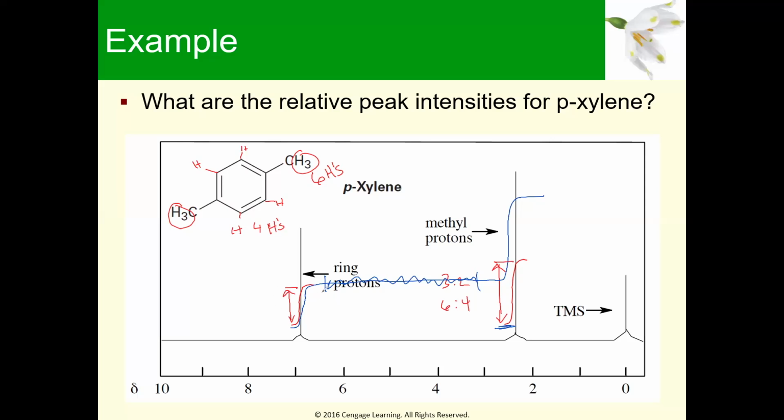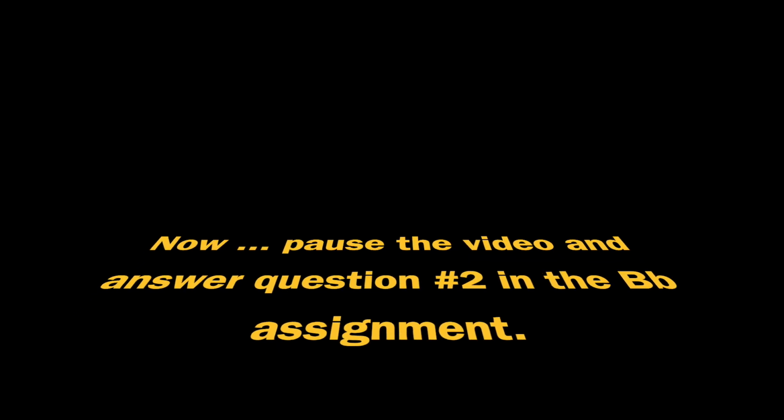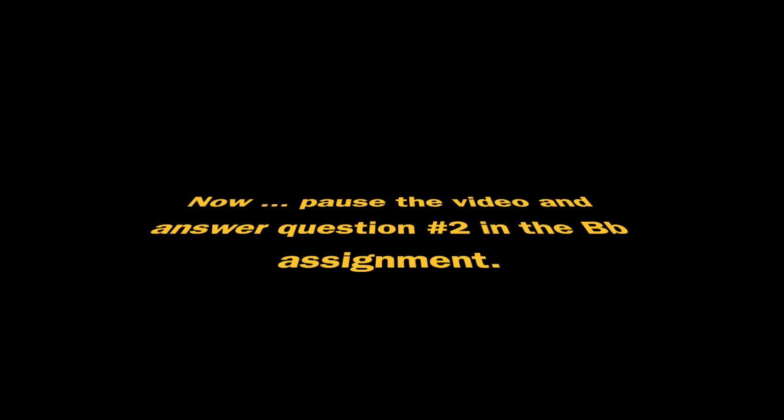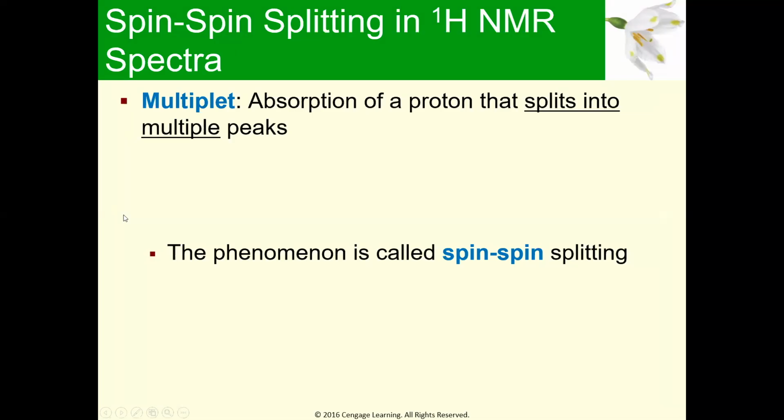But you always just measure from the top to the bottom and just take the difference. That's what matters, is that difference between the top of the curve and the bottom of the curve. That's the integration. All right, so that's integration.